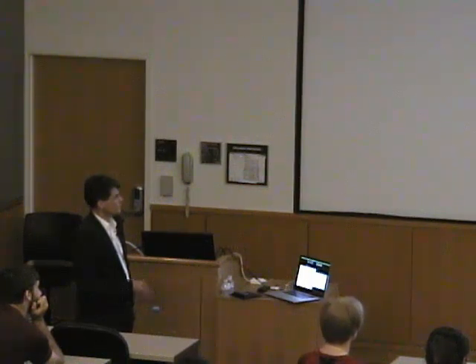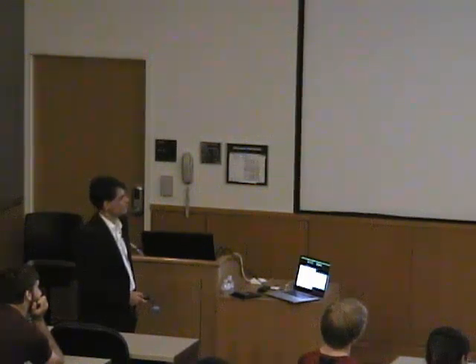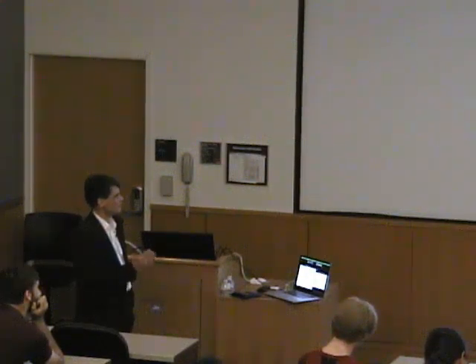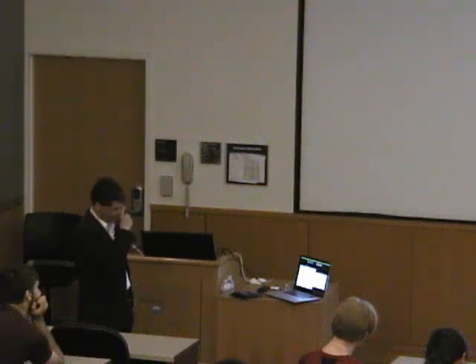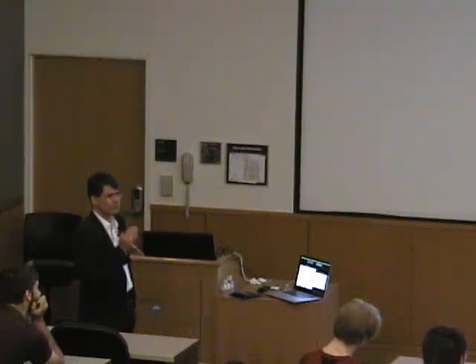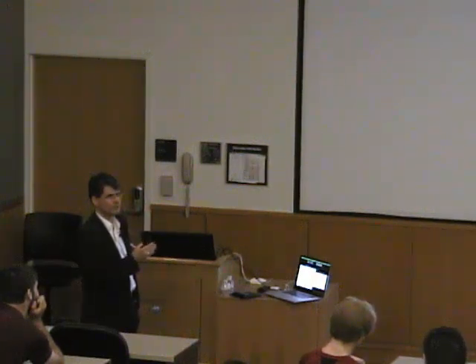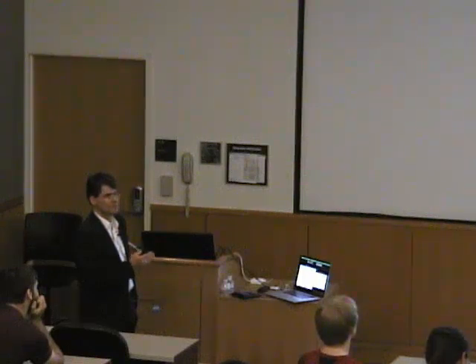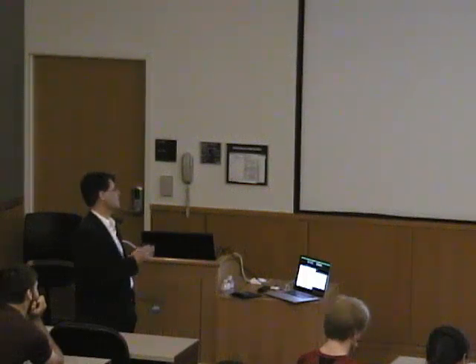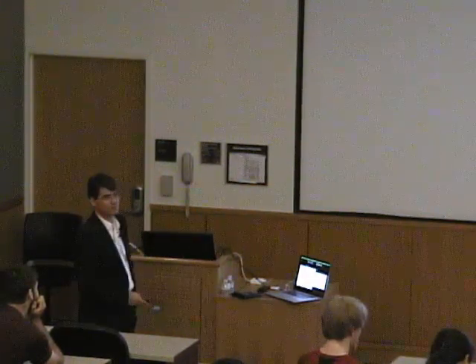And then there is, I think, an aspect that can't be overemphasized. It studies the ground and the electronically excited states at the same time. I will explain to you what I mean with that. And certainly it puts severe constraints on possible assignments. So if you're interested in going deeper into the electronic structure analysis, then MCD is definitely a very strong friend of yours. You don't have to do this. If you go out of this lecture and say, oh God, I don't want to have anything to do with that electronic structure crap, then you still have all of the rest that you can really use to your advantage.